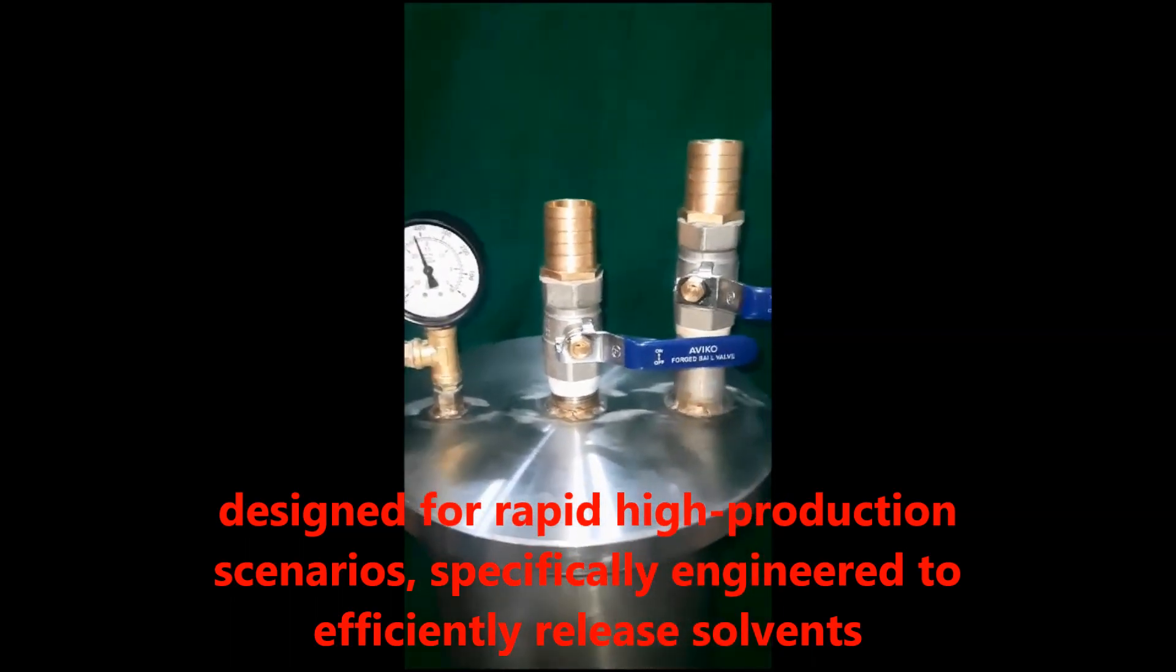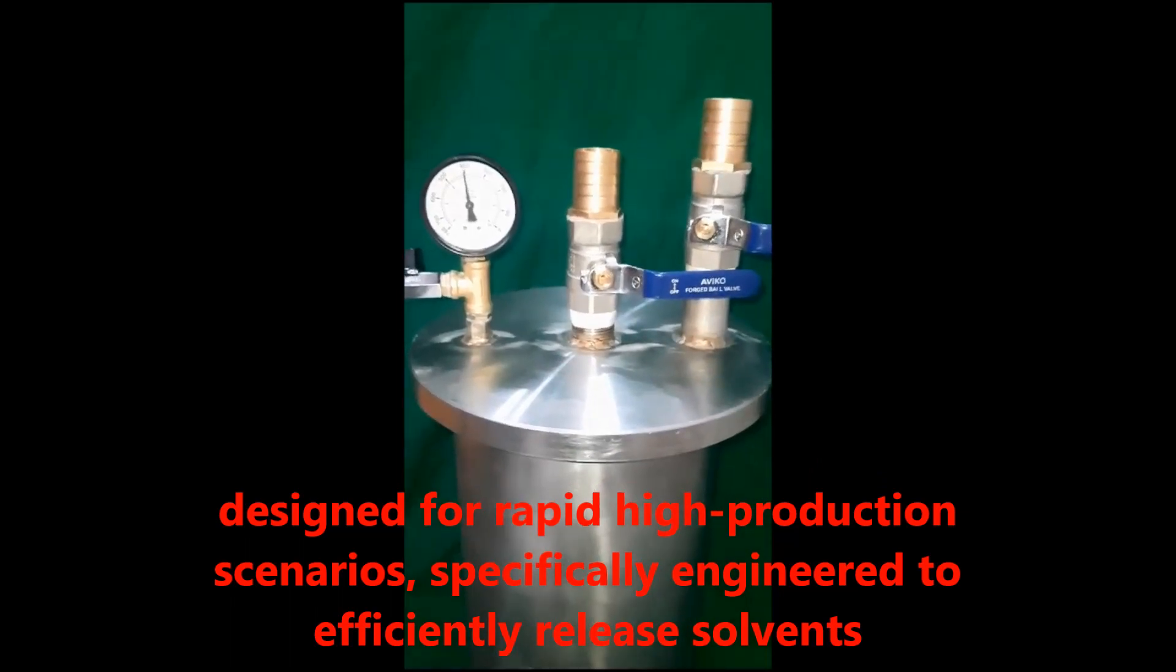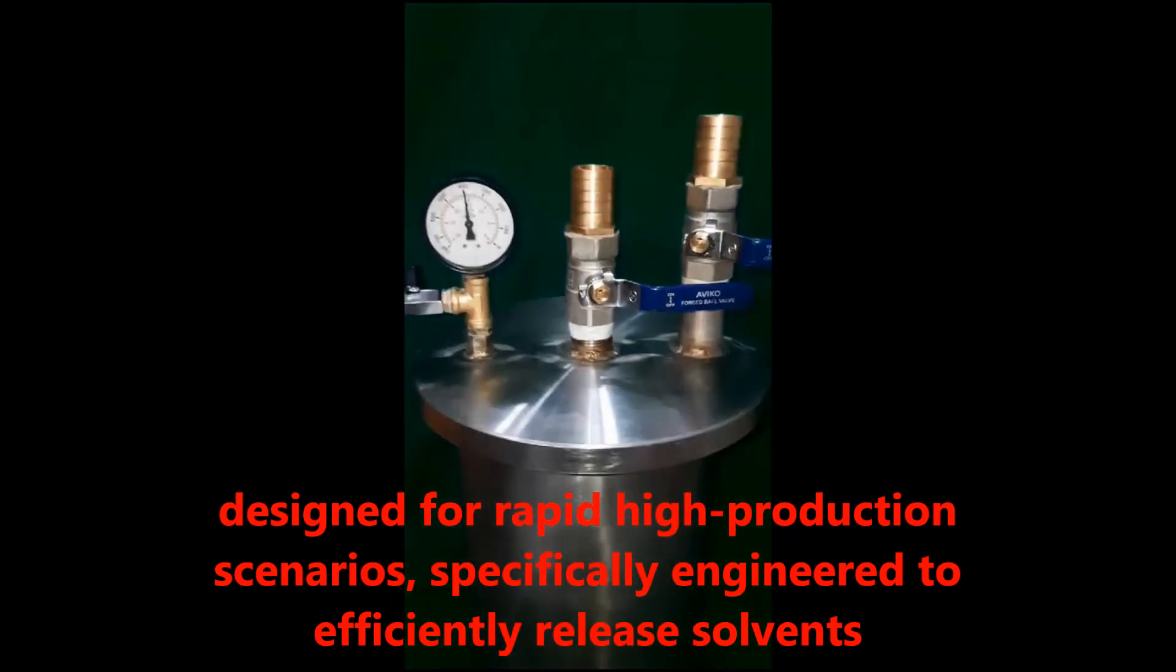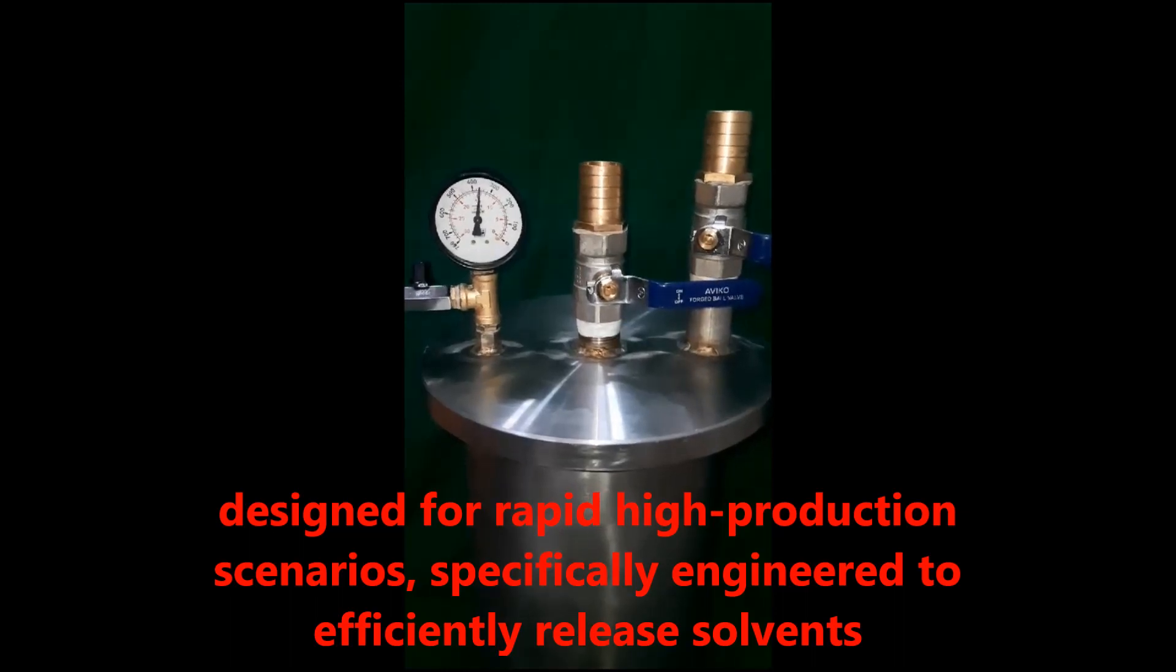This engineering marvel from Burhani Technology proves specially valuable in demanding high-production environments, offering rapid liberation of solvents with utmost efficiency.